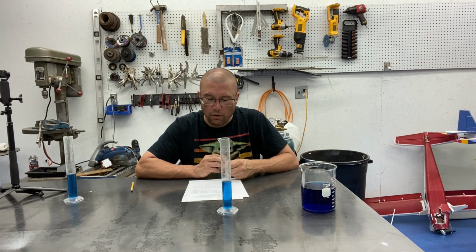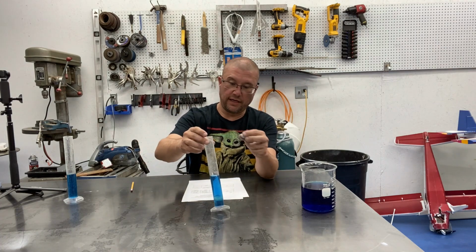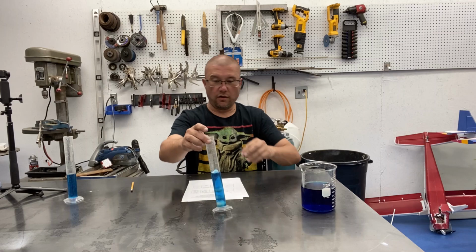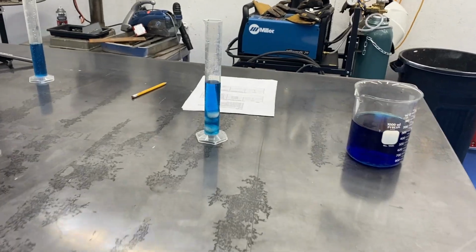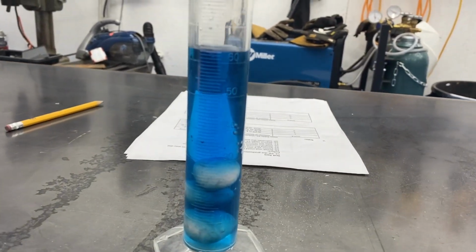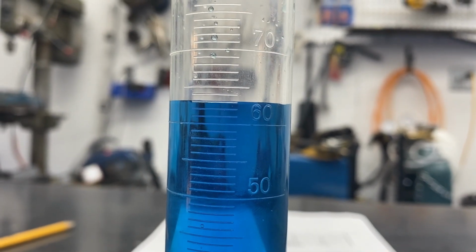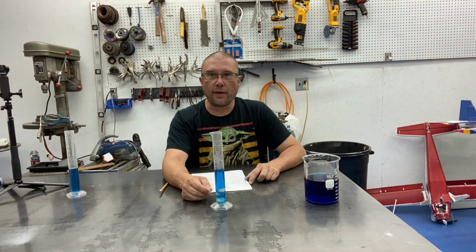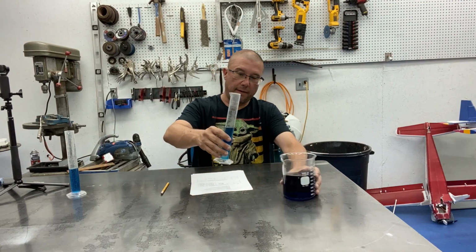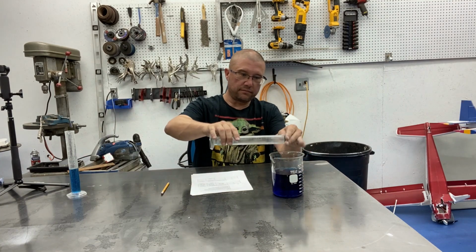Step 14 says lower all 3 spheres into the graduated cylinder. So we're going to drop each of the spheres in there, all the way down to the bottom. Now, all 3 spheres are in this. Test 2, trial 1, with 3 spheres. You can see them in the bottom, and we have 63 milliliters. So you saw that we had 63 milliliters. I'm going to dump this out. Get our clay spheres out.